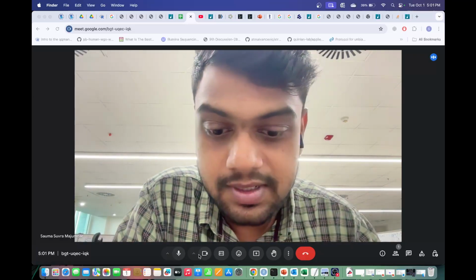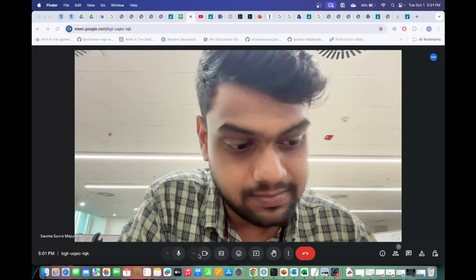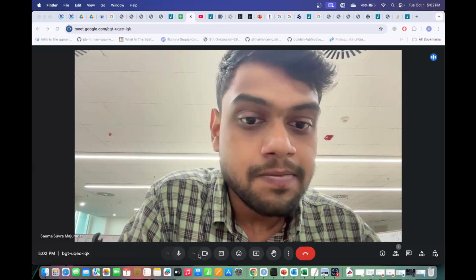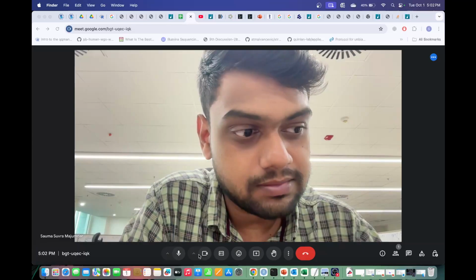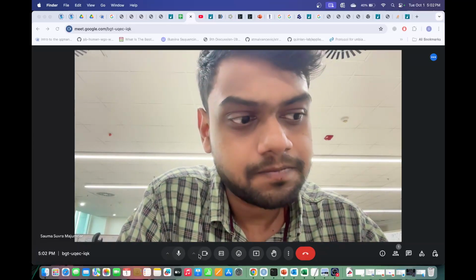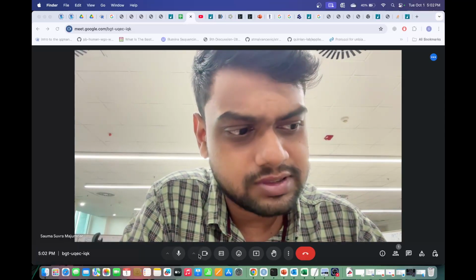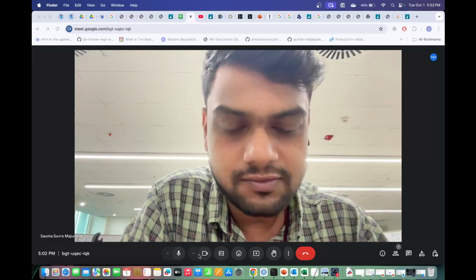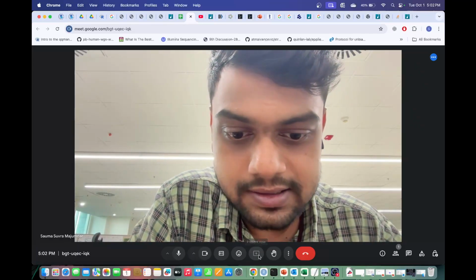So this class will be mostly covering the hands-on aspects of working with RNA-seq data and how we do that, mostly through R. Today is a hands-on session, and we'll go through the whole thing, starting from counts data and how we normalize it, to functional enrichment analysis. So okay, let's get started.